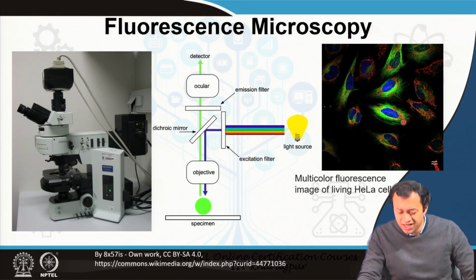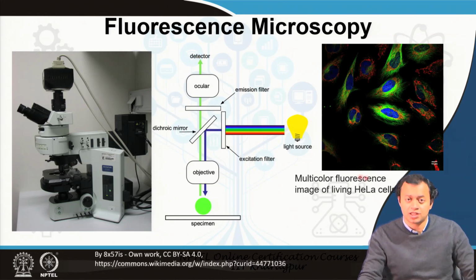I think, some area within the cytoplasm, and you send different types of pulse lights one at a time or simultaneously, and then use different types of filters to filter different light, again simultaneously or one at a time, and then you reconstruct the entire image.